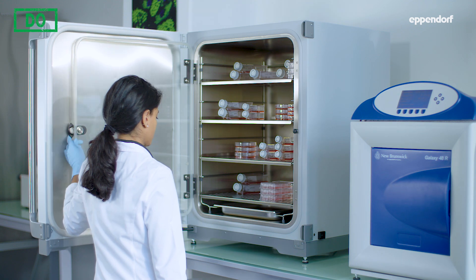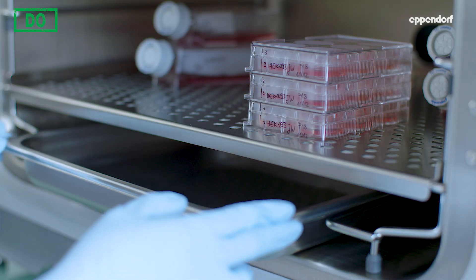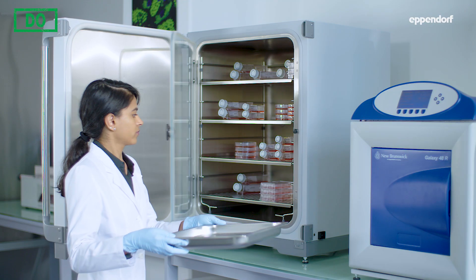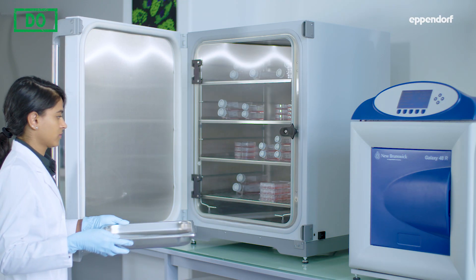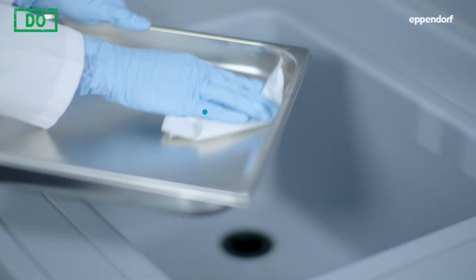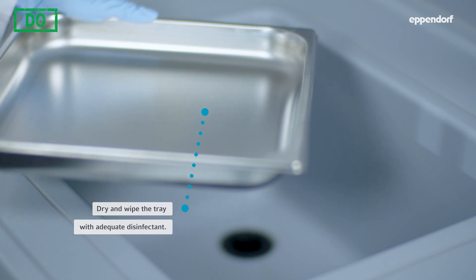To ensure that potential contaminants are removed regularly, the water reservoir must be removed, emptied, dried and disinfected. If the water reservoir is fixed inside the incubator, make sure the drain valve is also cleaned and avoid prolonged door opening.